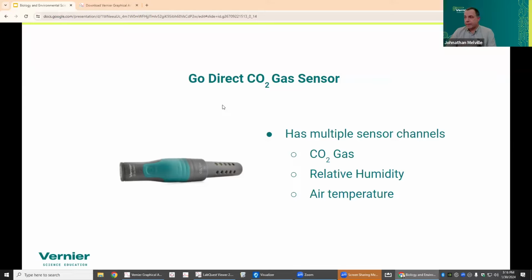The other thing that I didn't say right here that's actually kind of important is the Direct CO2 gas sensor is also humidity protected. So the sensor itself, the column inside of it where these holes are located right here, there's a little IR column and there's a casing around it that protects it from getting too wet. And it's also temperature compensated, which is something that the other sensor doesn't have. So it's going to compensate for changes in temperature. It's probably one of my favorite sensors.